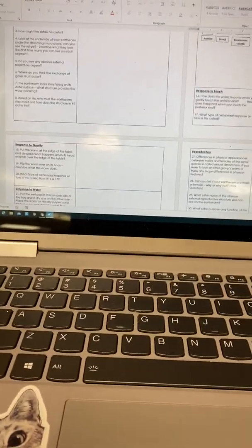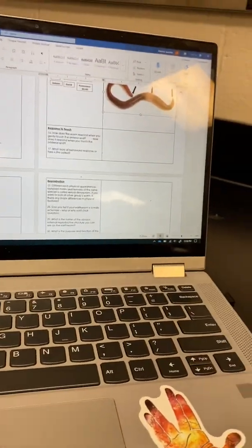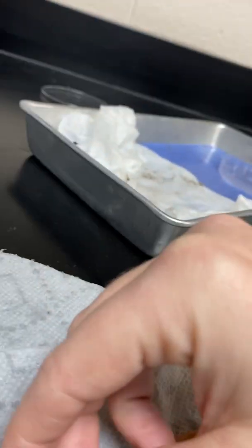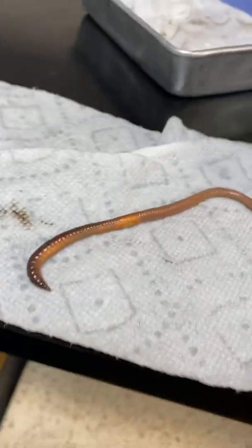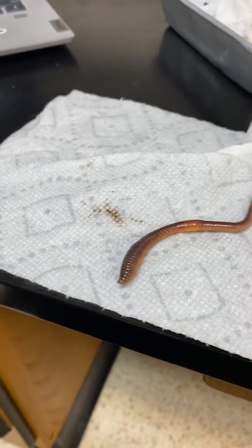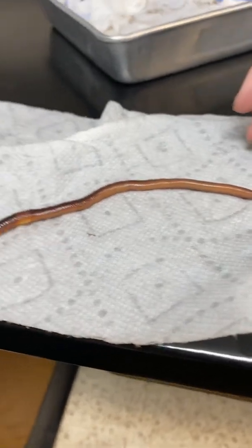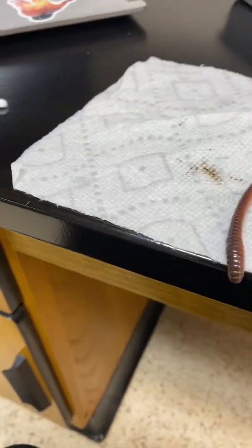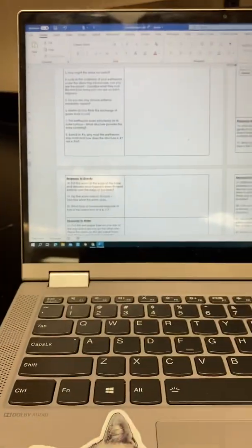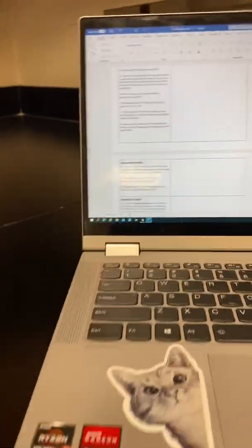And this one is flip the worm over on its back and describe what the worm does. So when you're upside down, you want to be right side up. It was on its back side, and it just rolls itself all the way over. Well, that's the edge. So what type of behavior response or taxis is this called for number 16 and 17?